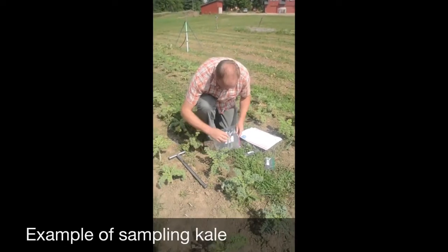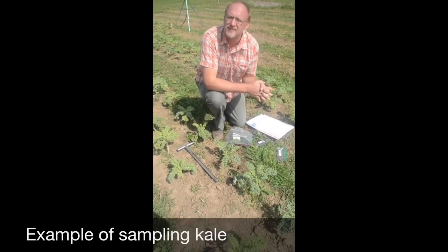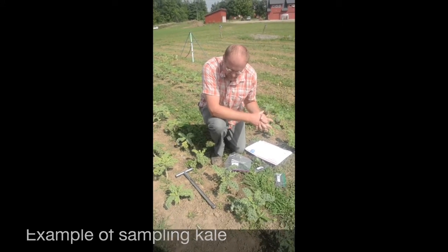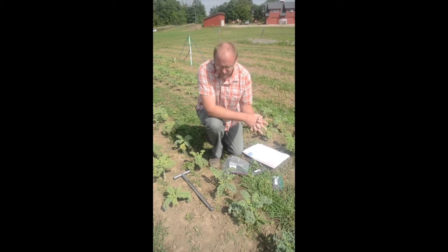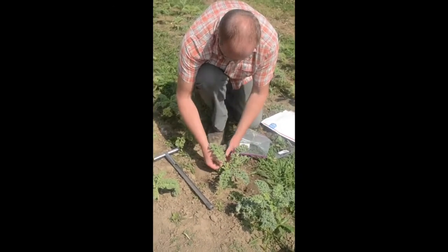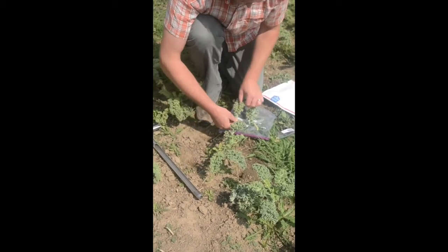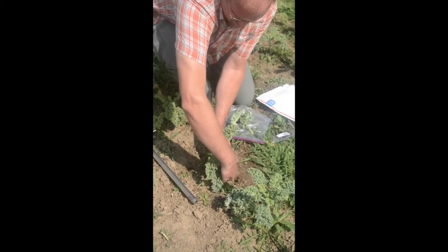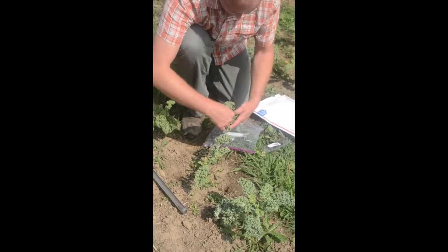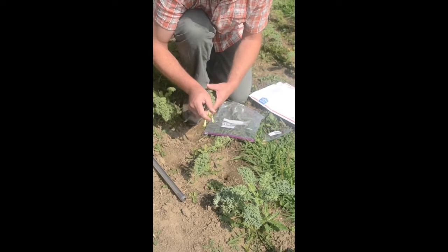And now I'm ready to take my vegetable sample. You want to take, depending on the size of the leaves, and it'll tell you within the app, it'll suggest how many leaves, but for kale, anywhere from 2 to 3 if you have large leaves, or even 4 to 5 if you have small leaves. So we start by just breaking these off at the stem. Now I've got 3 good sized leaves. These are a little bit on the smaller side, so I'm going to take a 4th just to be sure.